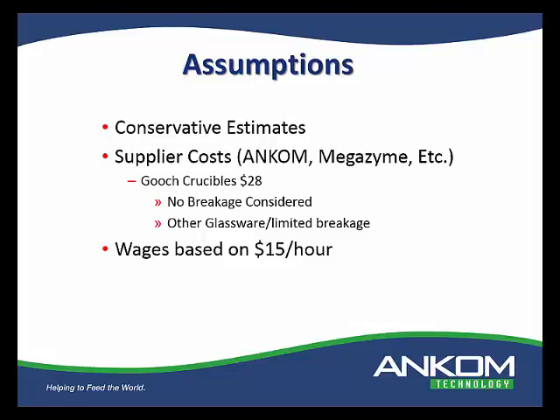We do sell a pre-concentrated enzyme from Megazyme. It's the exact same enzymes, but Megazyme was kind enough to go ahead, and actually they sell it as well, to make the dilution. So it's very simple to put together the solutions in our system. I believe it's 5 milliliters, 5 milliliters volumetrically brought up to 25.